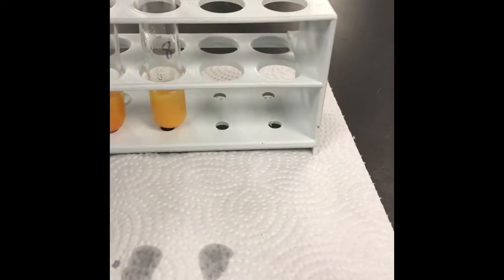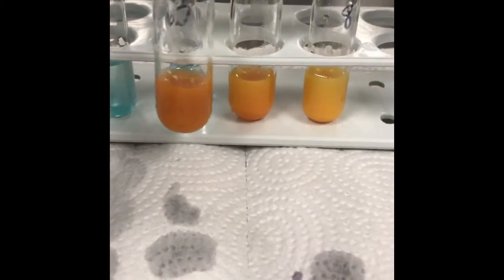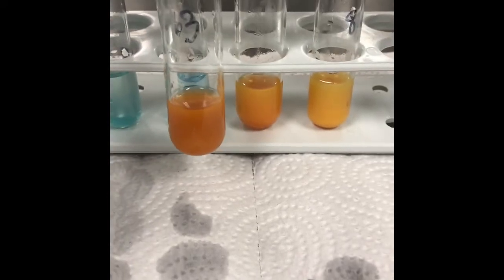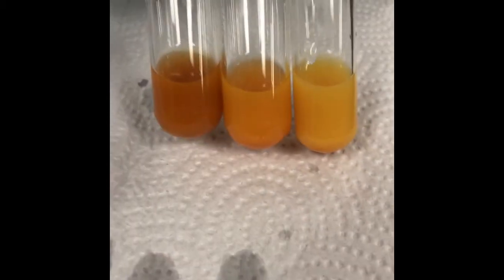If you want to see the 3 that are the orange color next to each other, this is 3 right here, before you see 7 and 8. So 3, 7, and 8. There they are, all 3 next to each other. That should give you a good display.